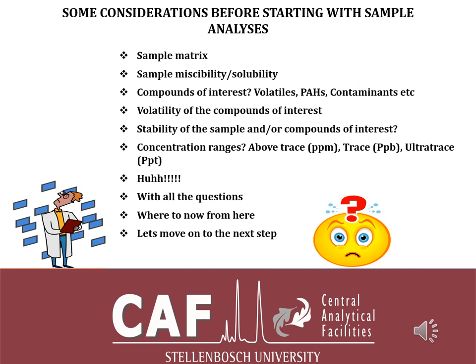So spend a little bit of time with the client discussing what they want, and also what their explanation of the contaminant is. I've heard in the past people speak of trichloroanisole, and they'll tell you, for instance, that the wine is corked. If the wine is corked, it can mean a lot of things. It doesn't necessarily mean it's trichloroanisole. It could be that there's some TDN, or you've got maybe a vitispirane in there, which gives a corked smell in the wine, but people think it is trichloroanisole.